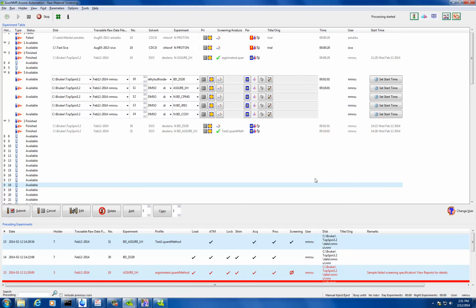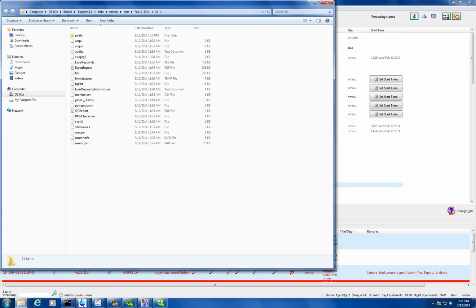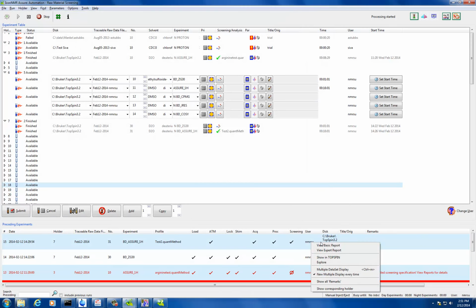Almost done. Now right click and go to expert report. Sorry, expert report, not export. When I do quick quantification, I have a report.